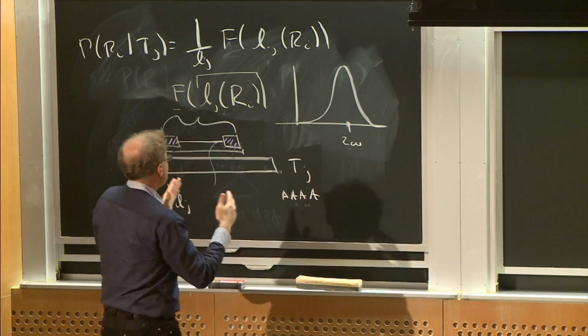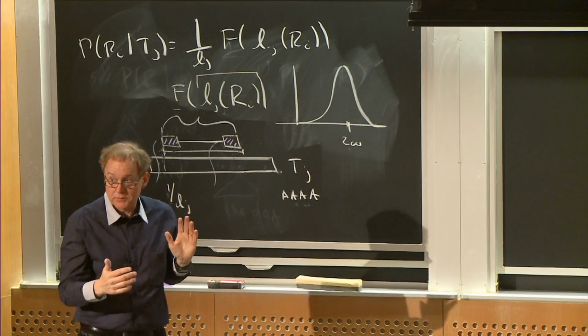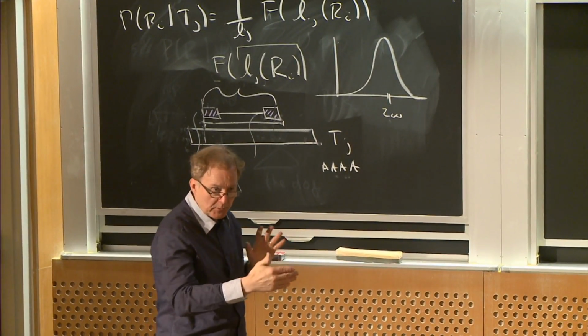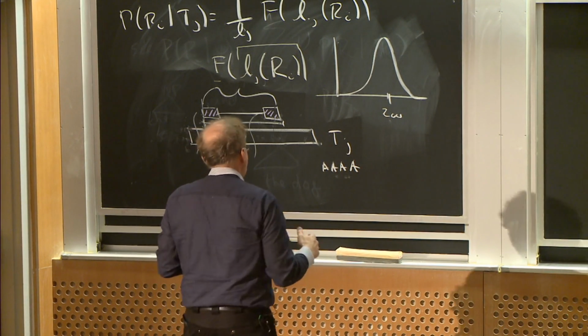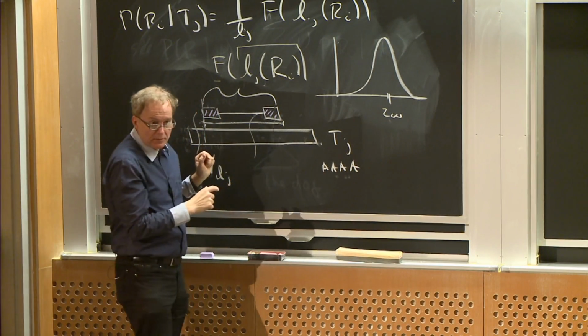And we get to choose how long these fragments are up to a maximum size. Contemporary sequencers don't really like fragments over 1,000 bases, and the performance starts falling off when you get close to that number. So people typically are operating in a more optimal range of fragments that are a few hundred bases long.